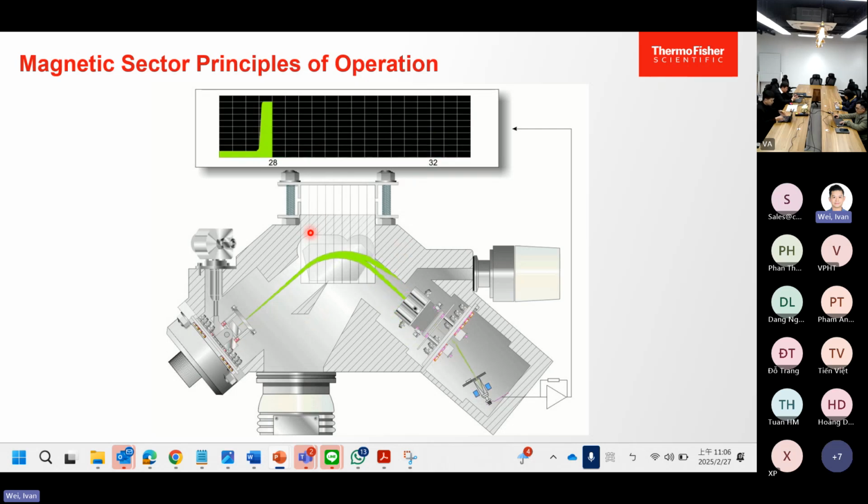So as you can see here, when the magnetic field changes, the ion beam changes its trajectories. Anything that has a mass of 28 will hit our detectors. And after the magnetic field changes, anything that has an ion mass of 32 will hit our detectors. So that's the principle of how we operate the mass spectrometers. We are detecting the gas mass, the fragment gas mass, and then we have a detector to see the signals, and we also convert the signals into concentrations.